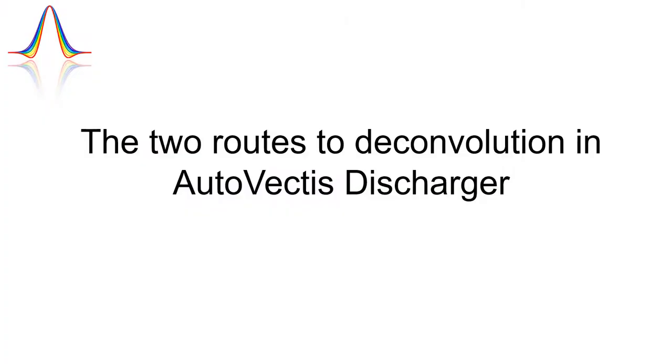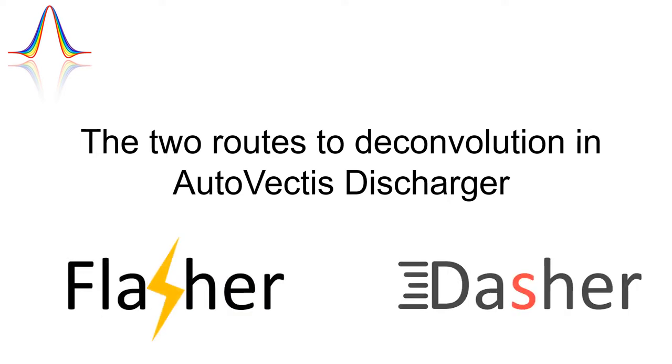So to recap, the large molecule low resolution deconvolution tool in the AutoVectis suite is called Discharger, and it offers two different algorithms for charge state deconvolution, known as Flasher and Dasher. Choosing the right algorithm will give you the best compromise between speed and coverage.